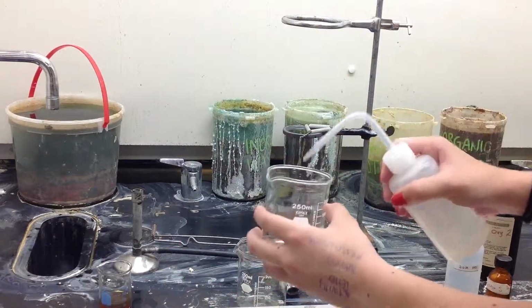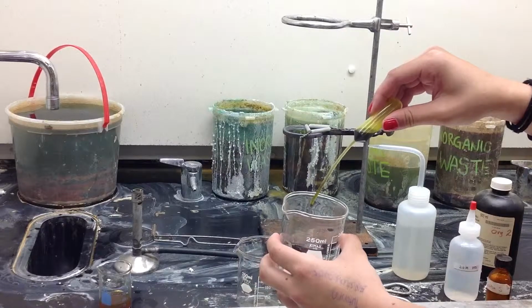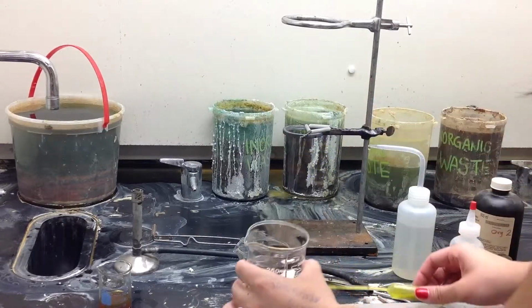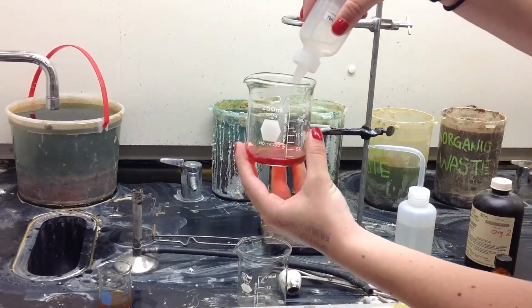Next, we will take another beaker and fill it with tap water and a few drops of universal indicator, and then we will add a few drops of hydrochloric acid. We will record the color of the solution, which is red and will be the control of an acidic solution.